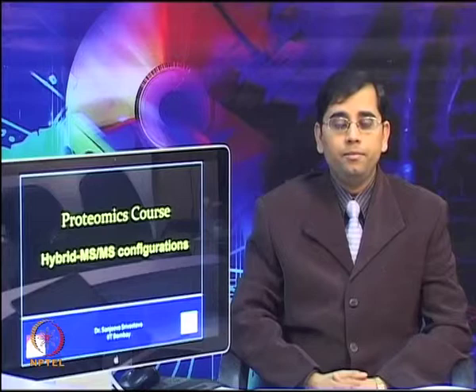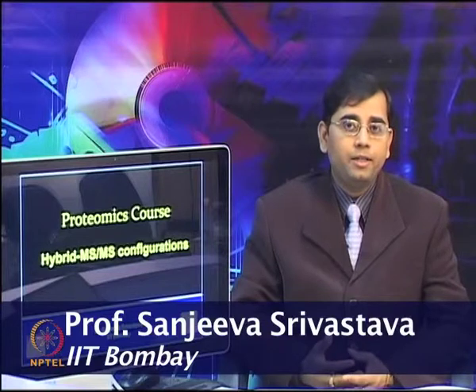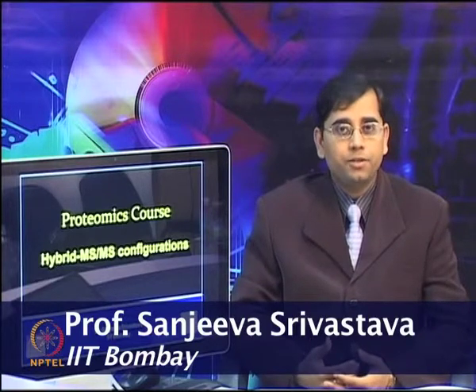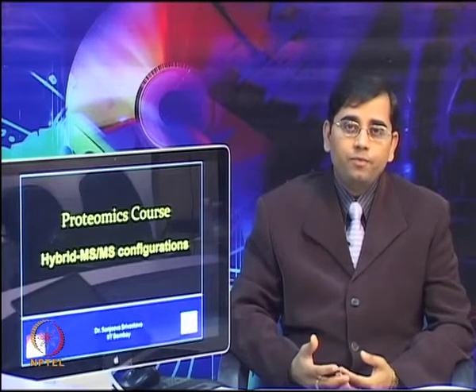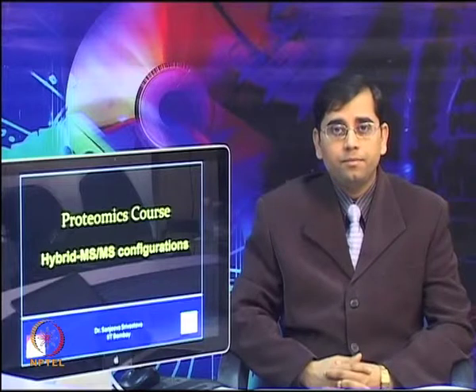Today we will talk about hybrid MS-MS configurations. As we have discussed, there are different types of mass spectrometers available, and depending upon the mass analyzers and how they can be used together, different types of MS-MS configurations, hybrid MS-MS, have emerged. So, we have discussed that different types of hybrid MS or tandem MS can be used for various proteomic applications.